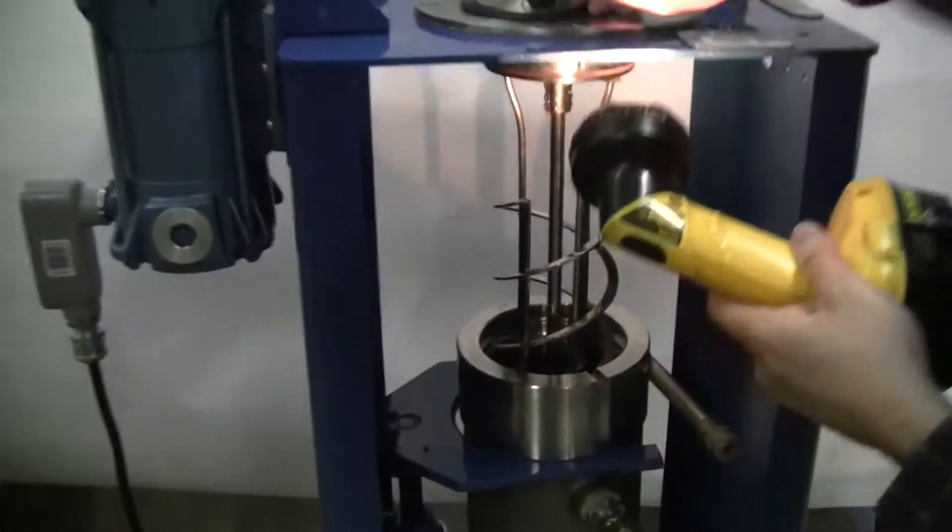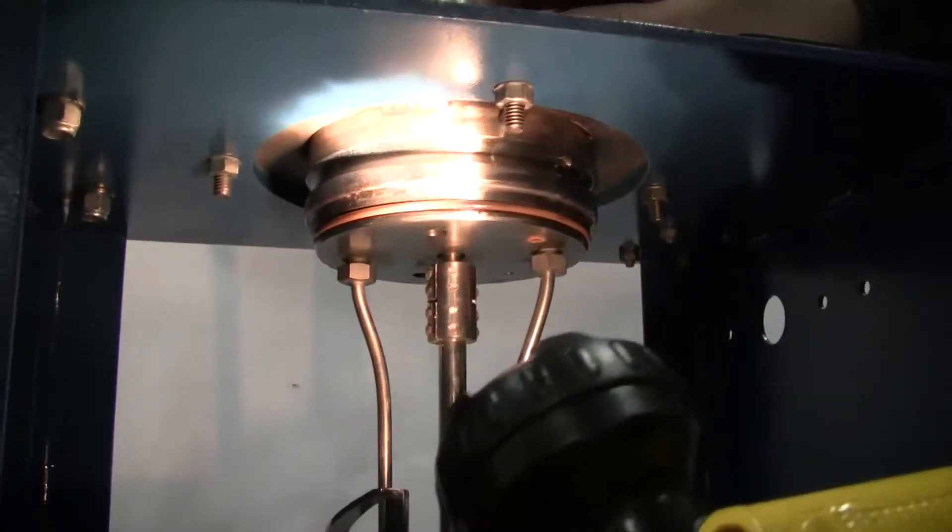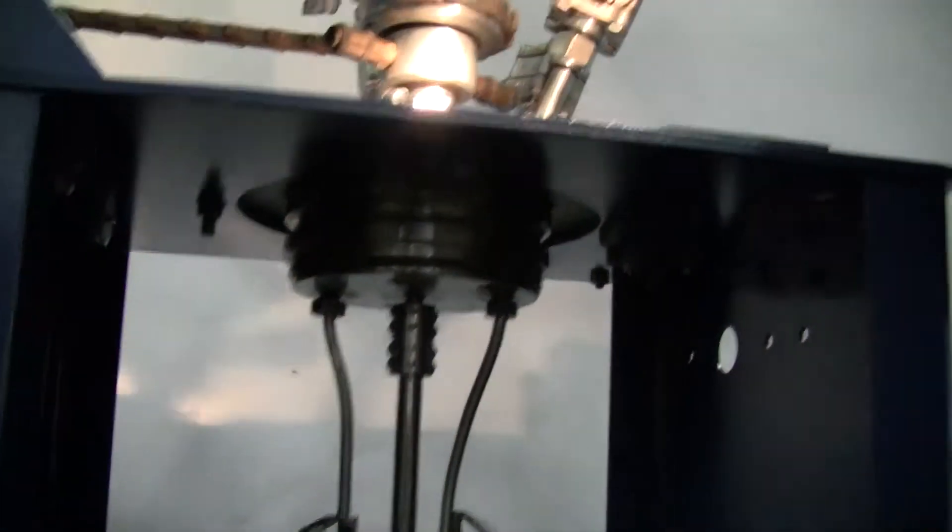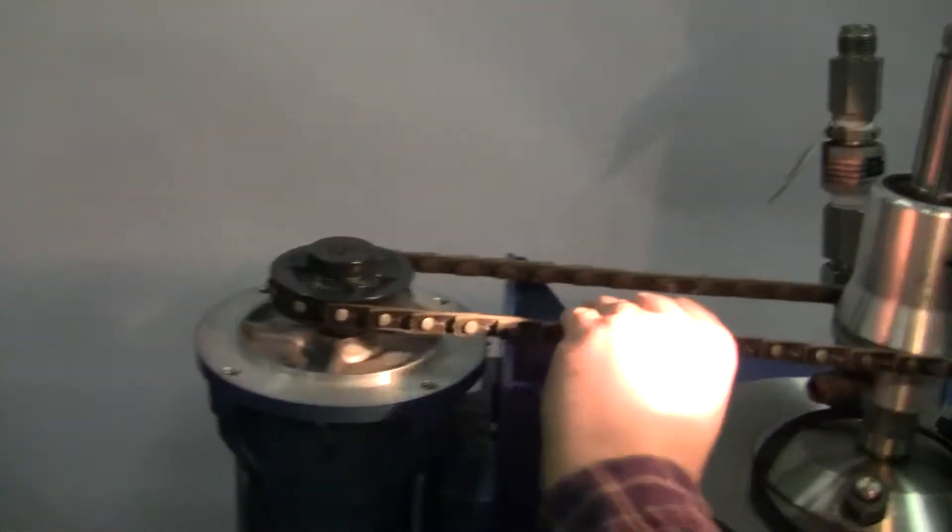I've given you two more seals for underneath. You can see the seal there. It comes with a zipper. Here's your top, your belt, your mag drive with your motor.